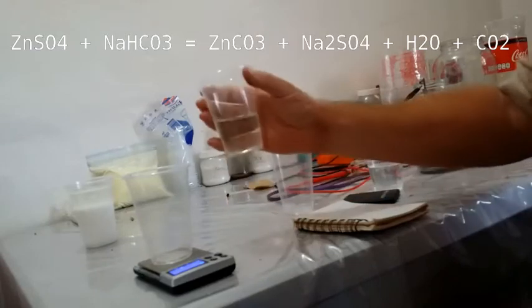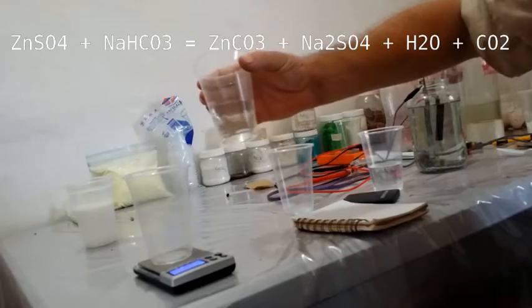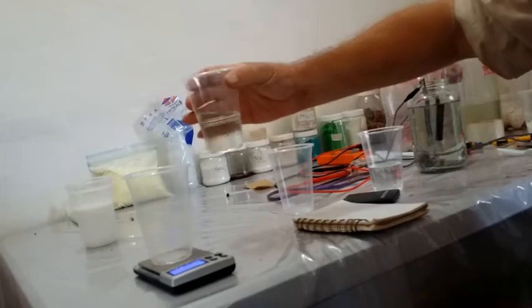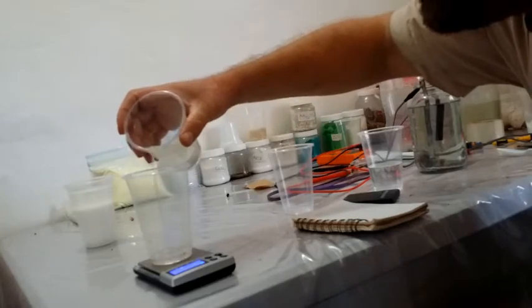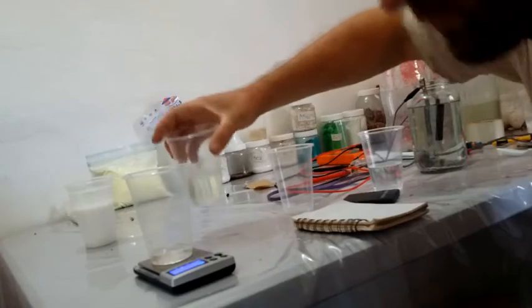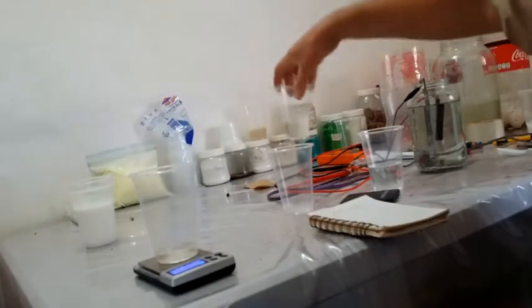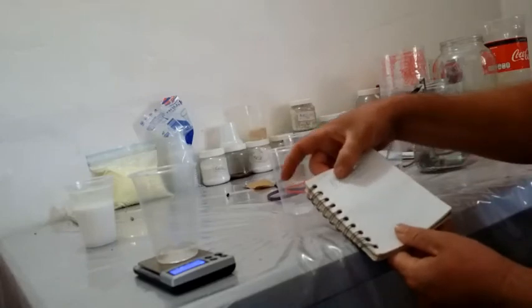I'm going to measure out 20 milliliters of this. This is roughly a 3.5 molar solution. That's roughly 20 milliliters there. In 20 milliliters of that solution there's about 11.3 grams.